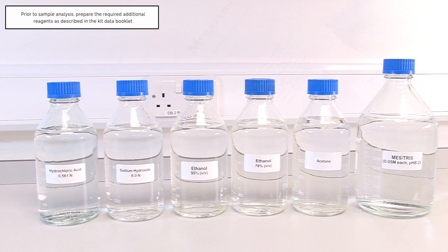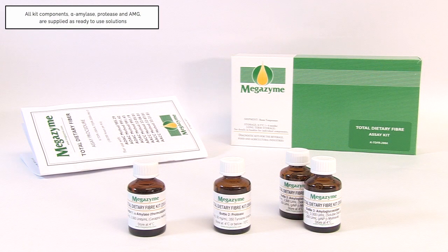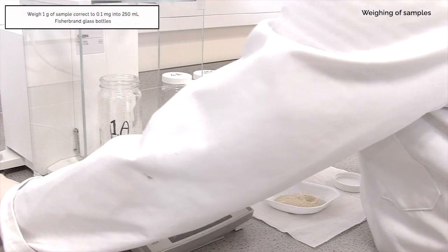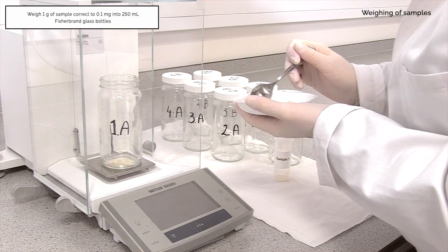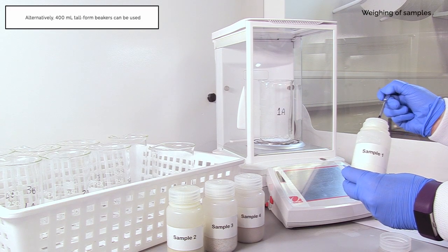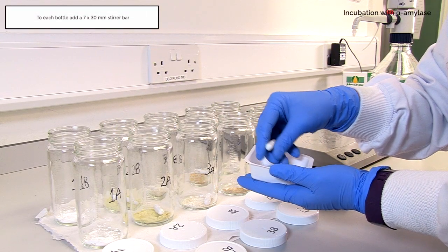Prior to sample analysis, prepare the required additional reagents as described in the kit data booklet. All kit components — alpha-amylase, protease, and amyloglucosidase — are supplied as ready-to-use solutions. Weigh 1g of sample, correct to the nearest 0.1mg, into 250ml Fisher-Brand glass bottles. Alternatively, 400ml tall form beakers can be used. To each bottle, add a 7x30mm stirrer bar.